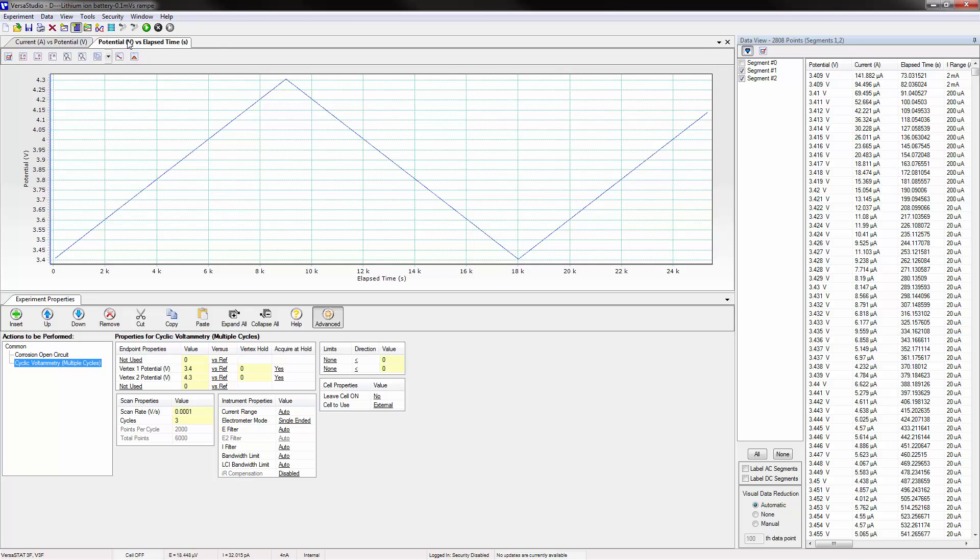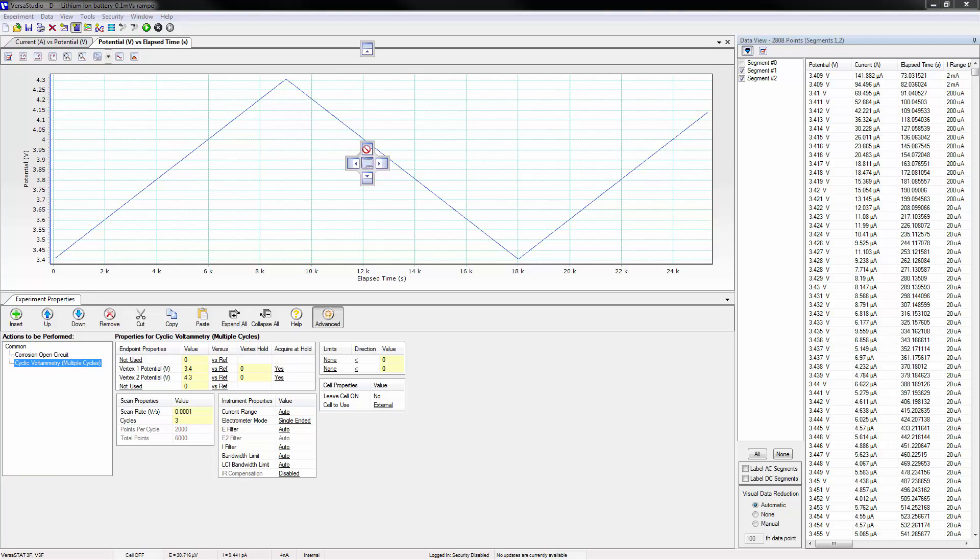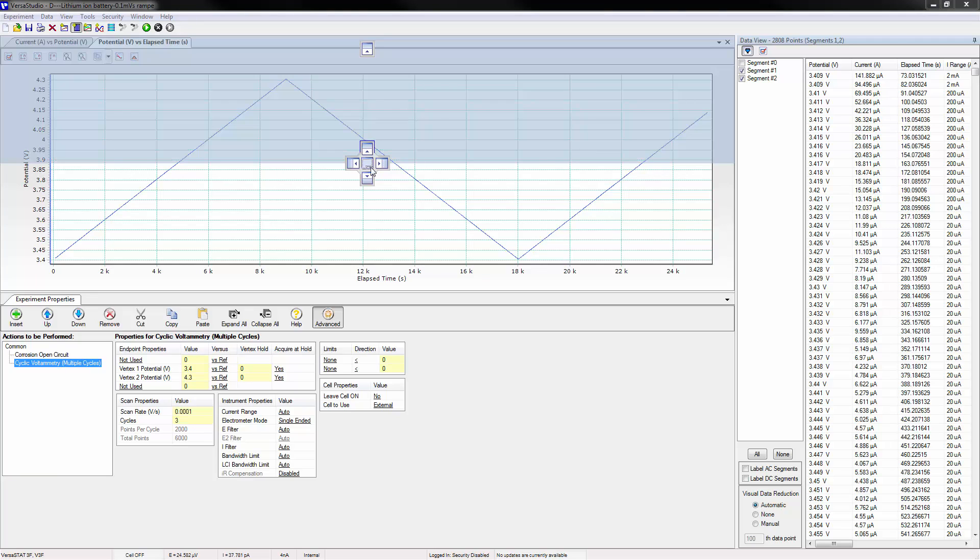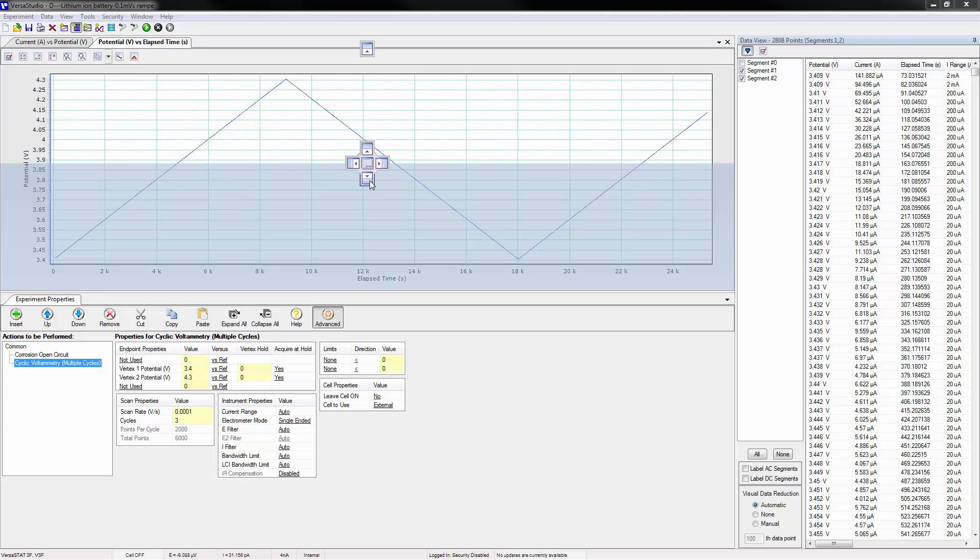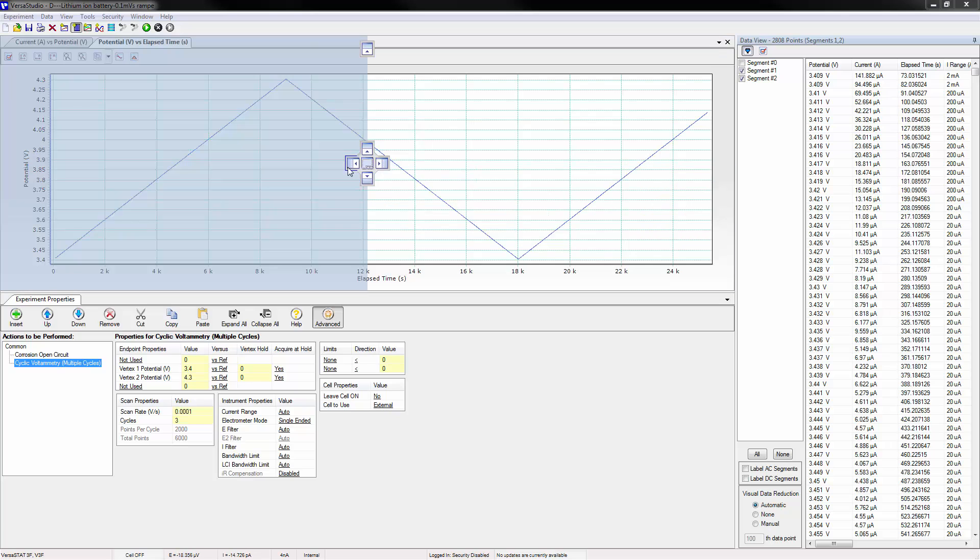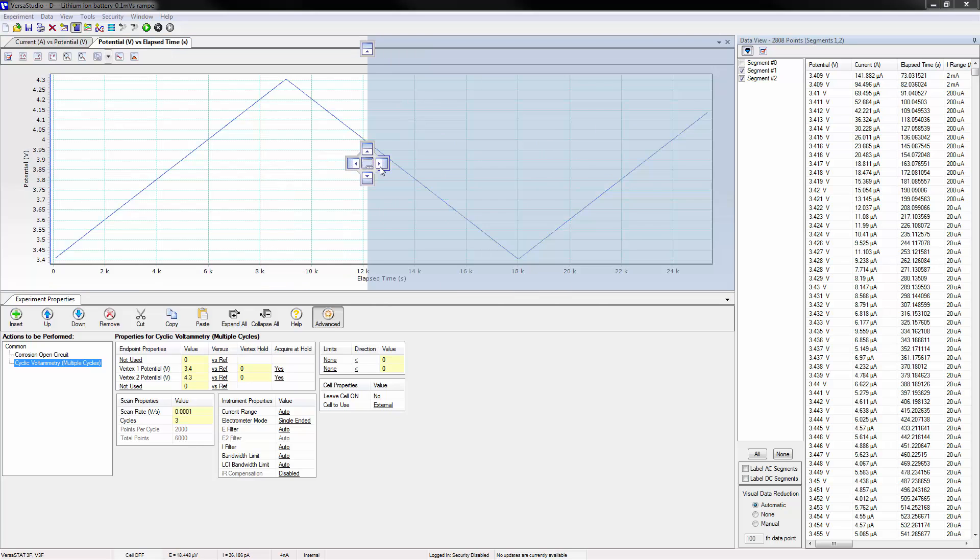Alternatively, the graphs can be rearranged to be side by side. This is accomplished by simply left clicking one of the tabs and dragging the mouse until the options appear. The graph can then be docked on the top, the bottom, the left, or the right.